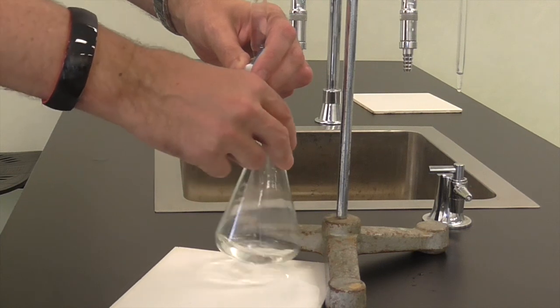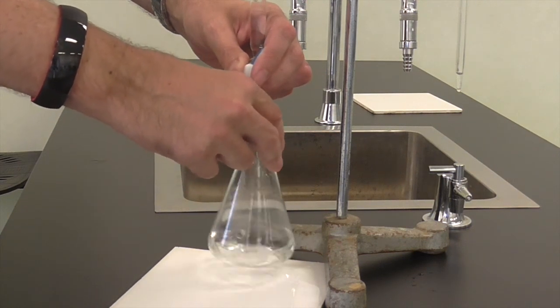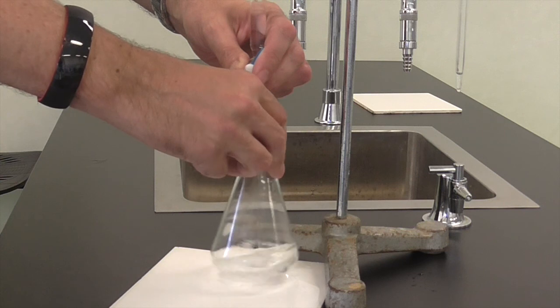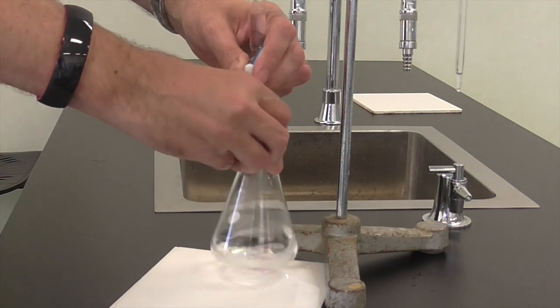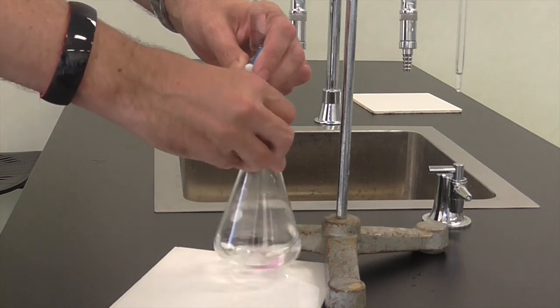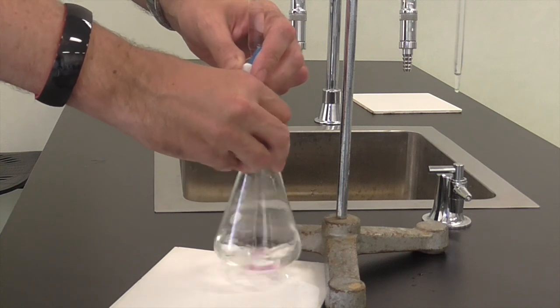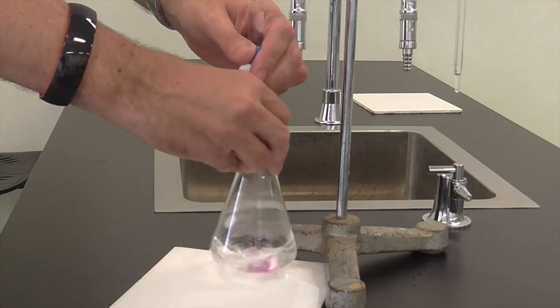So gently open the tap, swirl the conical flask as you're adding and keep doing this. Control the flow rate, so to a few drops every second or so. You'll start to see the solution at the bottom change colour as the drops are added.